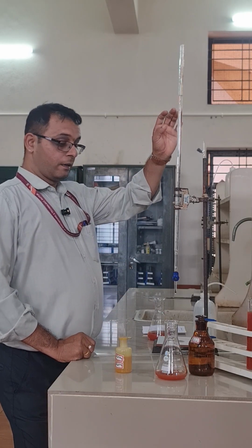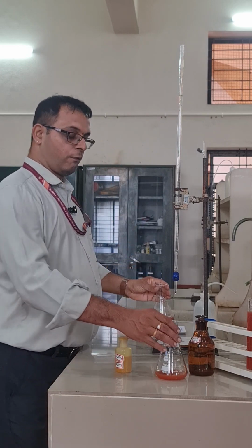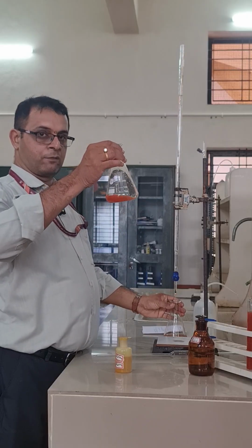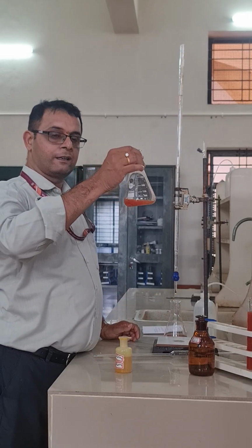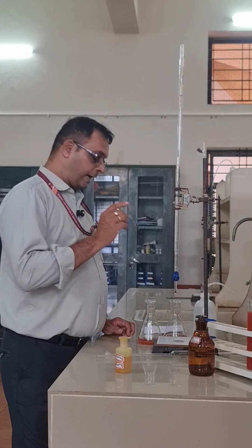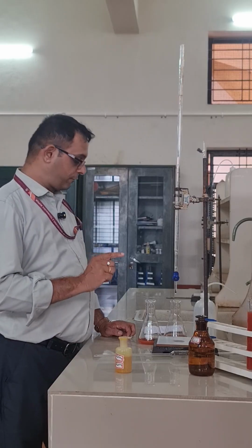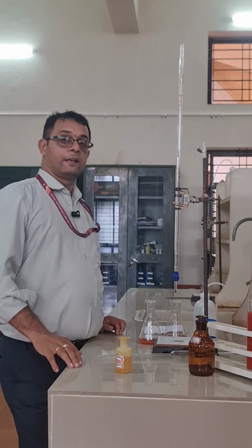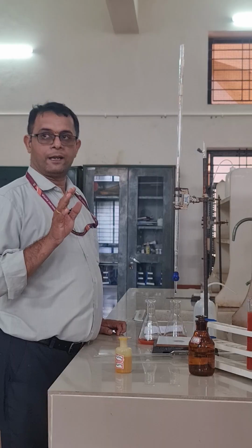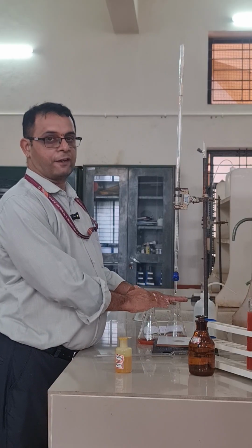V1 was the amount of AgNO3 consumed for the sample. V2 is the amount of AgNO3 consumed for the blank, that is for the distilled water, right? V1 and V2. So the formula is V1 minus V2 into 35.45 into 1000 divided by the ml of sample which I have taken. Now I have taken 25 ml in both.